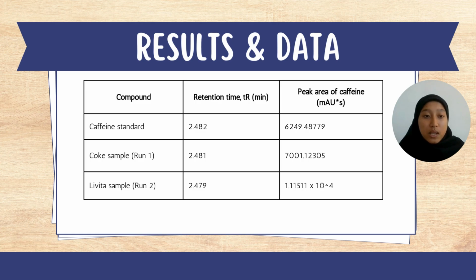Based on these values, we can say that they have the same range of retention time, which indicates that they have the same compound present, which is caffeine.